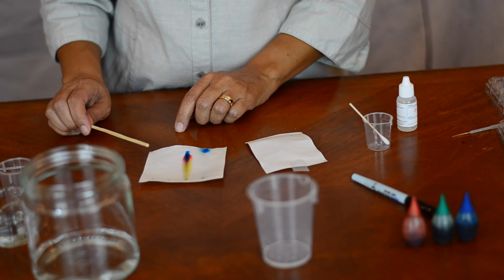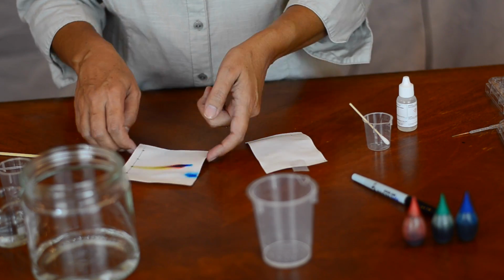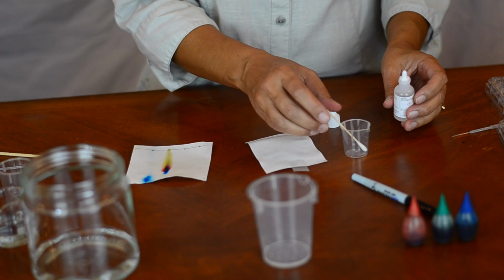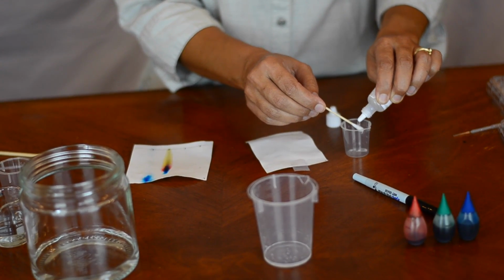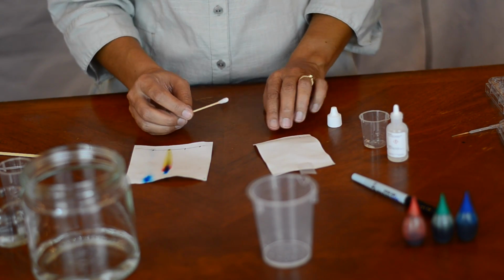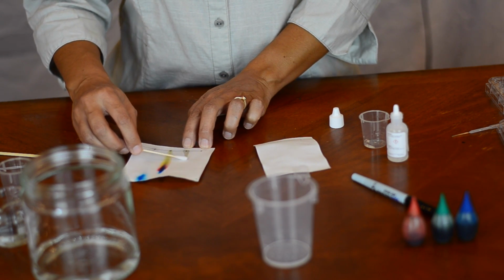So what is in this area is our copper nitrate, lead nitrate solution, and we can't see them, they're clear. So we're going to take our third reagent, the potassium iodide, and put a few drops into a plastic beaker. I've already got my cotton swab sitting in there because it's the cotton swab I want to moisten. So I'm just getting that nice and wet. And then I'm going to rub the potassium iodide on where I expect my copper nitrate, lead nitrate solution to be. So I've marked its spot here.